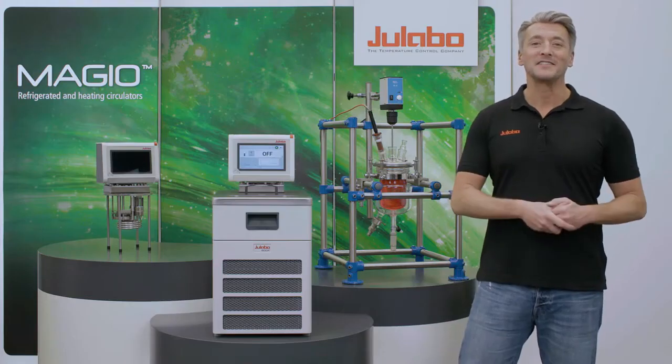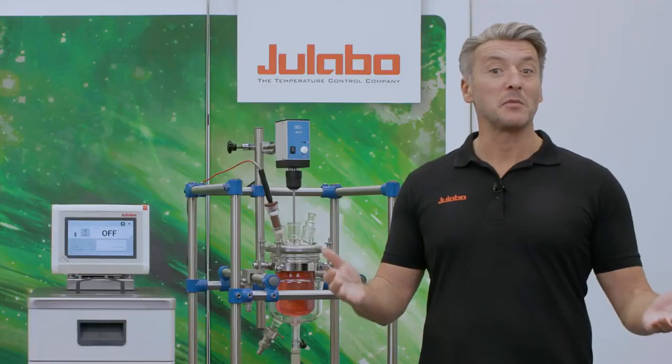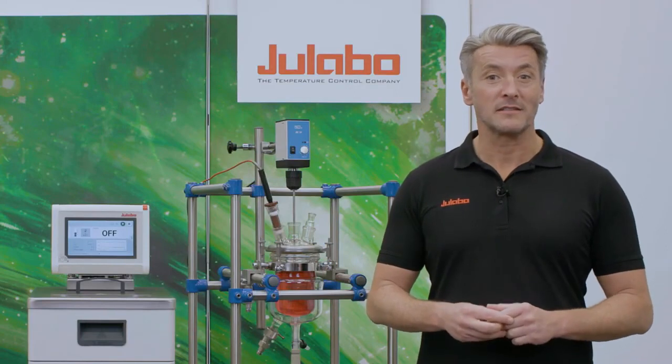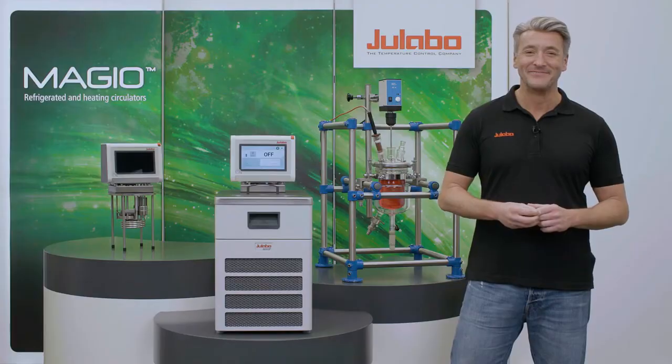I will show you how easy it is to connect an external application to our Magio circulators. In this case, we will connect the primary circuit of a glass reactor, which the Magio will then control the temperature of. Let's have a look at the Magio.